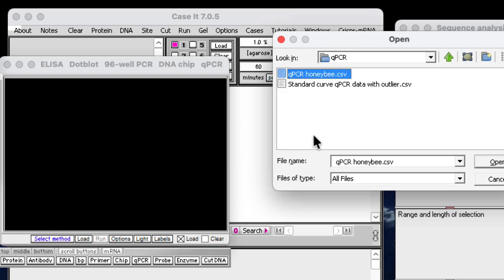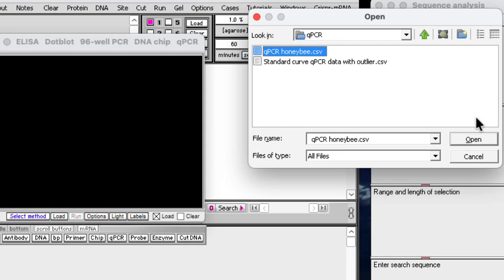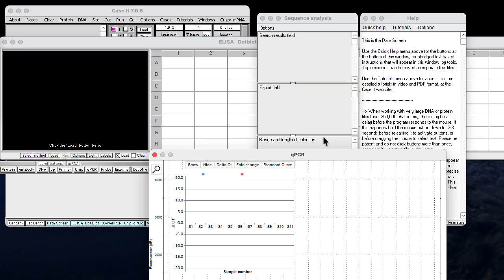That's because this data came from an actual research project at the University of Wisconsin, River Falls. It's very difficult to get a hold of fluorescence data for HIV patients, so we will use this as a surrogate data set. And we'll only be using part of the data set. So I click the Open button to open the data.